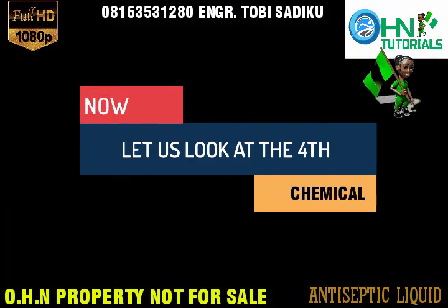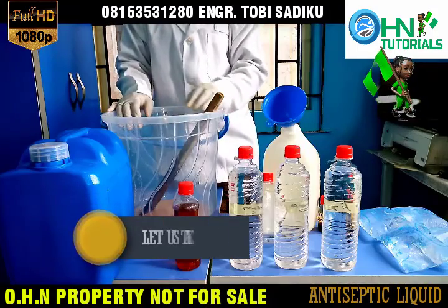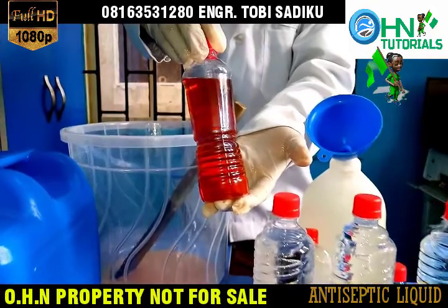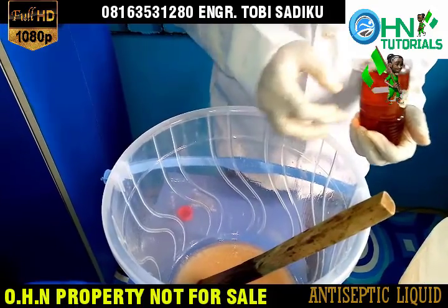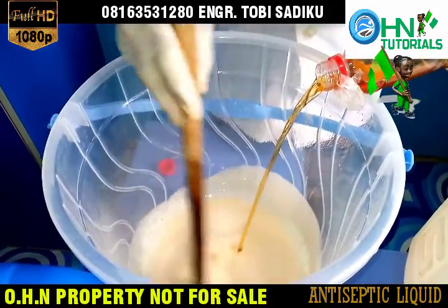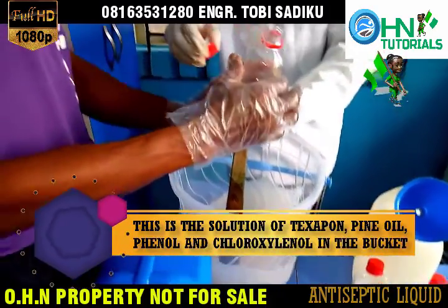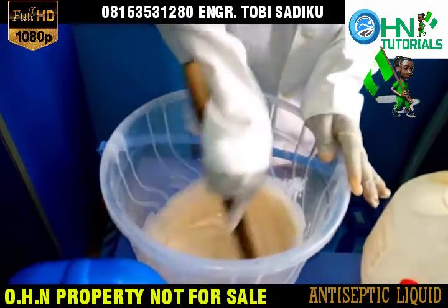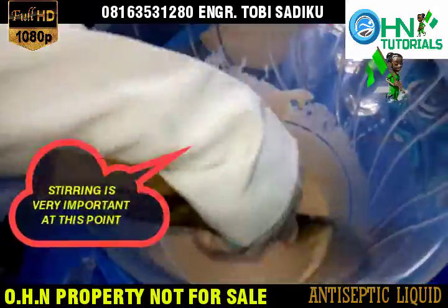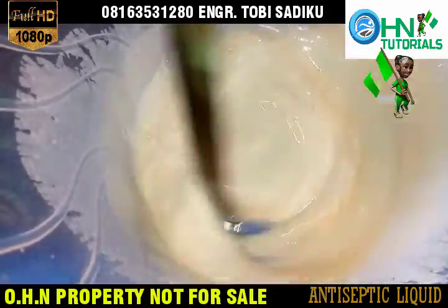Now let us look at the fourth chemical. Let us take a closer look at the Chloroxylenol. No big deal — just pour the chemical. This is the solution of Texapone, pine oil, Phenol and Chloroxylenol in the bucket. Stirring is very important at this point. Good job.